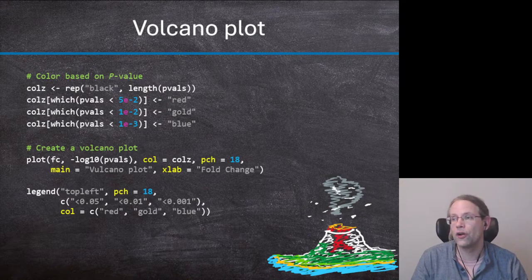So it's a lot downregulated in the one medium compared to the control medium, but it's not significantly different. So here we see the group between 0.05 and 0.01. This is between 0.01 and 0.001. And these are the couple of genes which are very, very significantly different. But you can see that for some of them, the difference is relatively small, right?